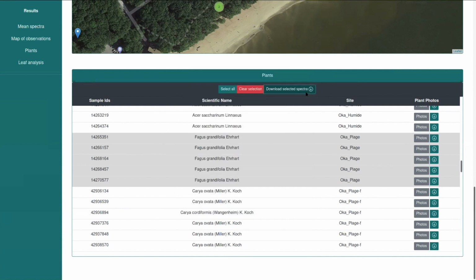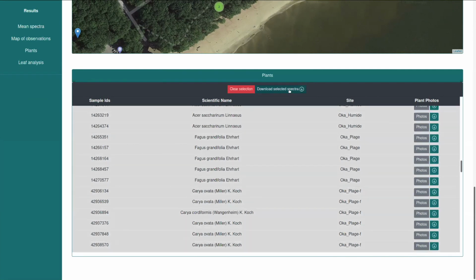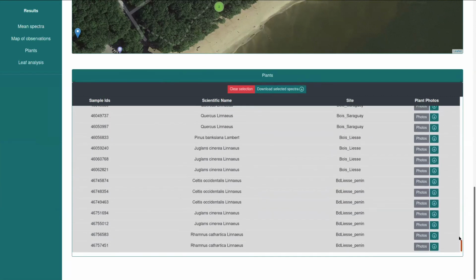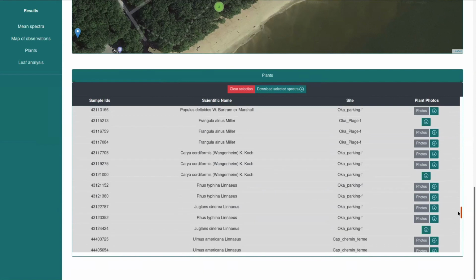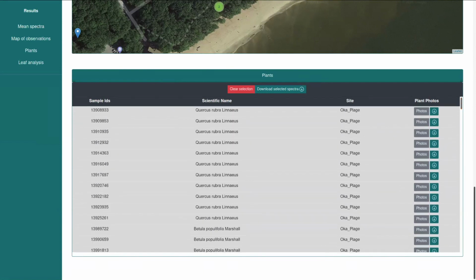So you can technically clear the selection, select all, and then download the selected spectra. That's going to give you 157 times thousands of rows. Some of these files can get really big, really fast. So I have to find a way, because if you want to download hundreds and hundreds of spectra, this is going to be several hundred megabytes, and downloading them live like this on a web interface is not the best way. But right now it's working.